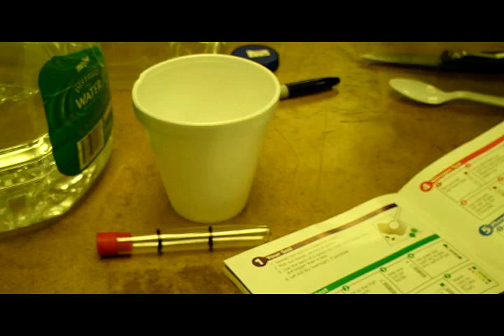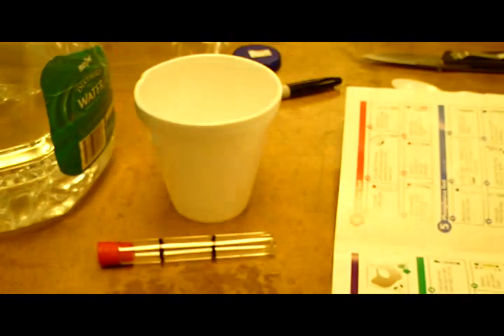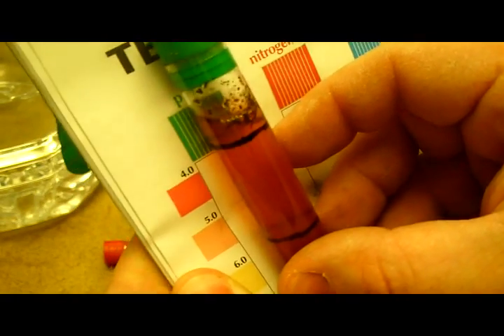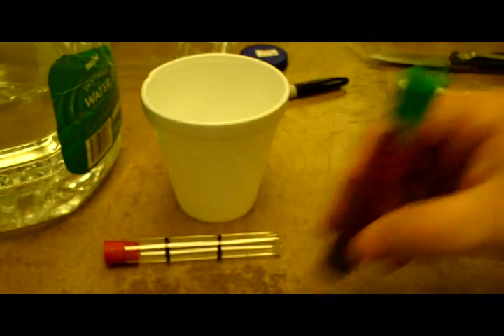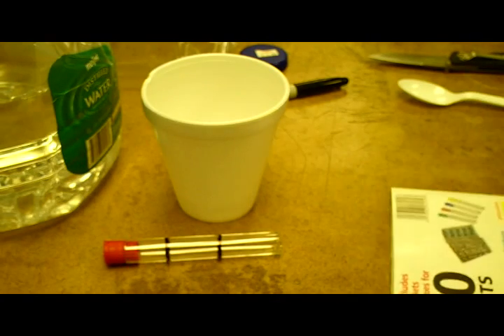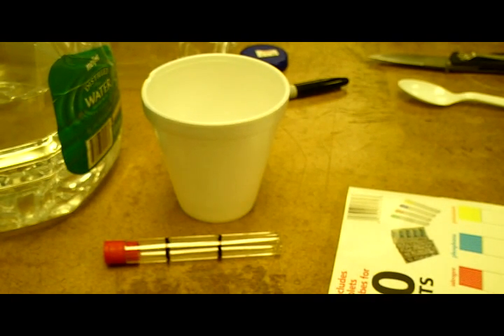Let it stand and settle for one minute, or until a clear colored solution is visible above the soil layer. Then you just match it to the color chart. It's been a little over a minute and the sample is settled. It looks like between a four and a five for pH, and I'm thinking it needs to be around a seven, so that's going to take a lot of lime.